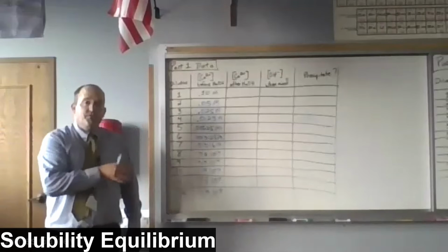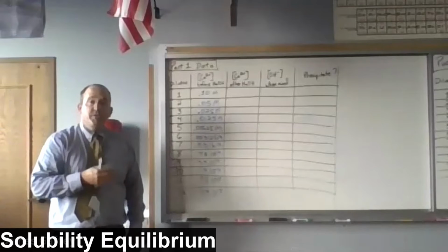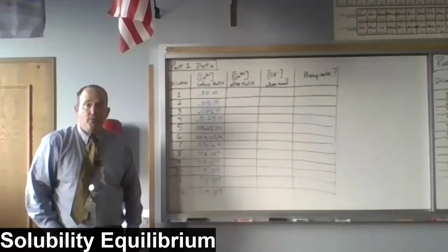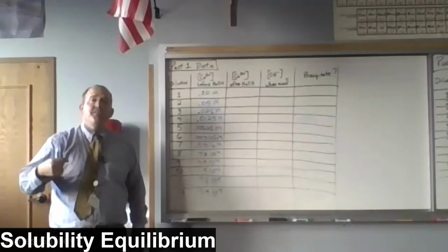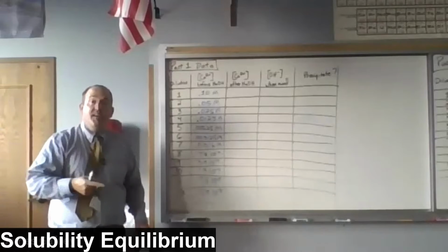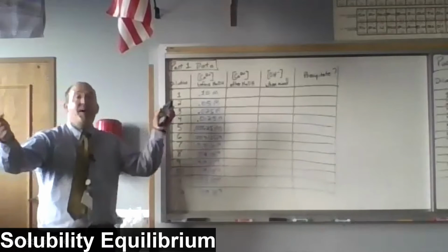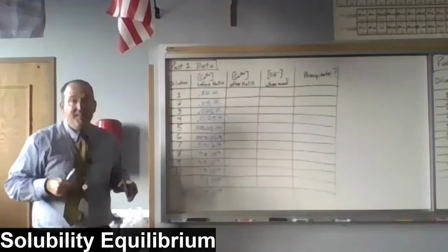All of those concentrations are the result of serial dilution before we added the sodium hydroxide. When we added 5 drops of sodium hydroxide, then the calcium ion concentration went down by half once again.